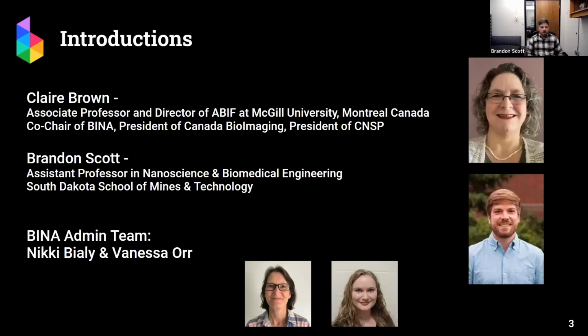Next slide. So since I'm unmuted, I will talk about myself first. I am an assistant professor in nanoscience and biomedical engineering. As it says here, I'm at South Dakota Mines in Rapid City, South Dakota. And in terms of the instrumentation, right now we have a home-built lattice light sheet that'll be the discussion that I'm interested in.